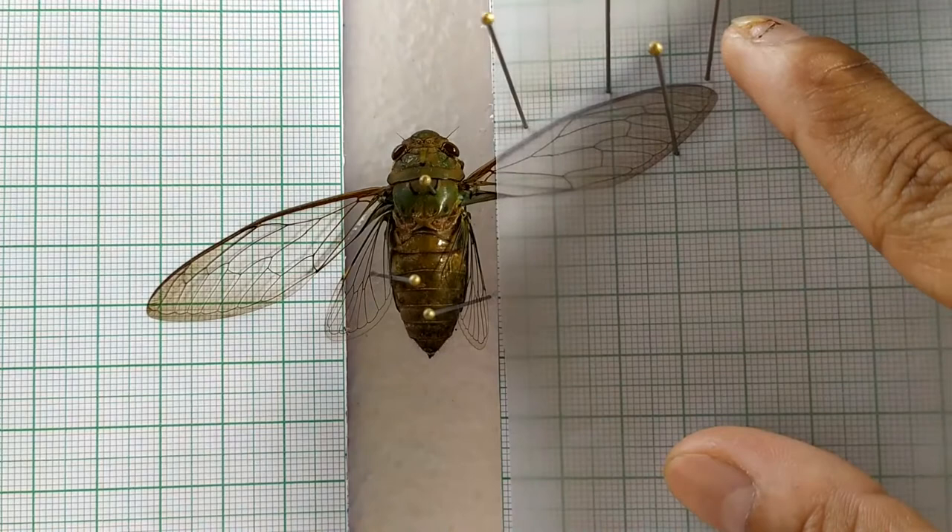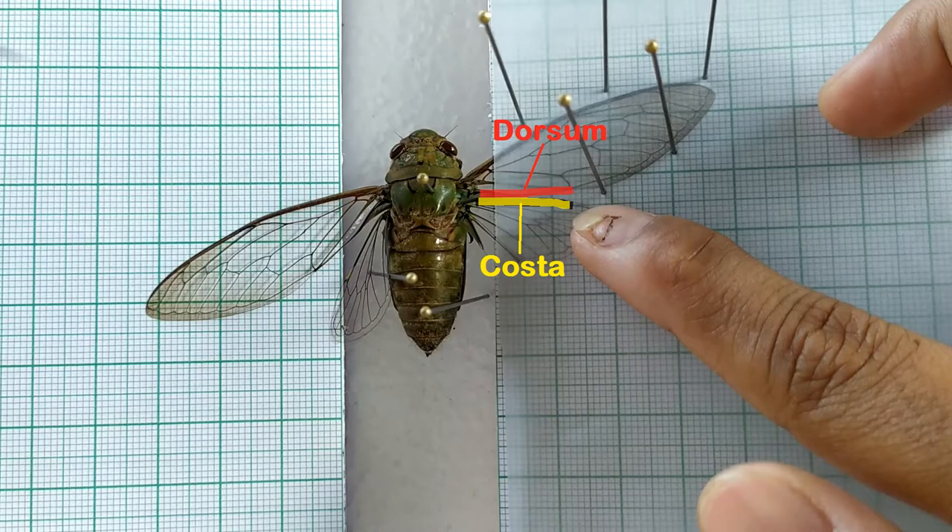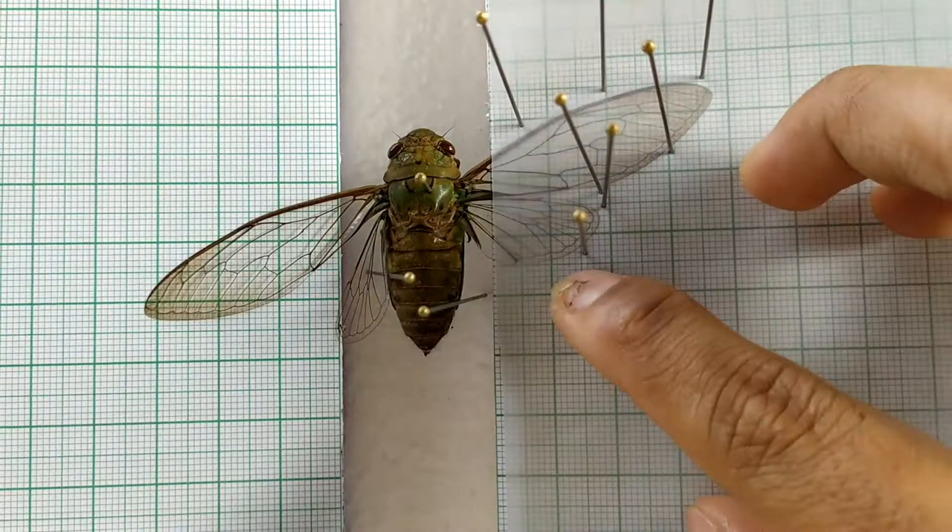Follow the same process with the hind wings. Position the hind wing such that the costa of the hind wing lies just below the dorsum of the forewing. Secure the hind wing by inserting pins through the butter paper at several places along the margin of the wing. Do the same with the wings on the other side.